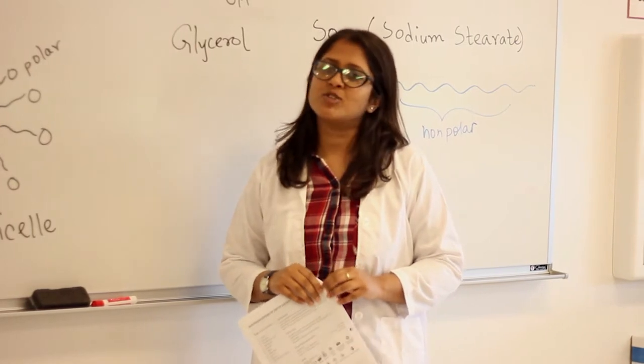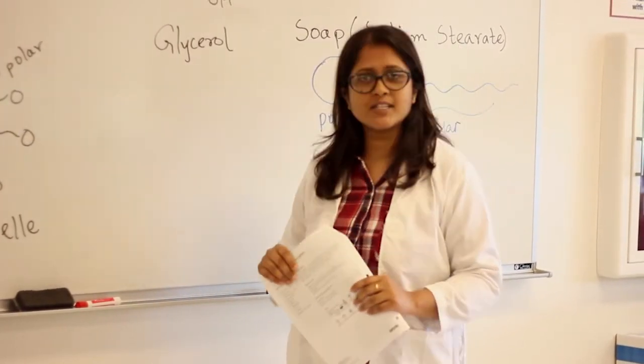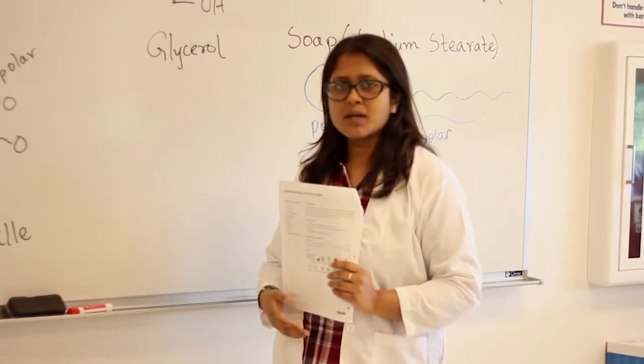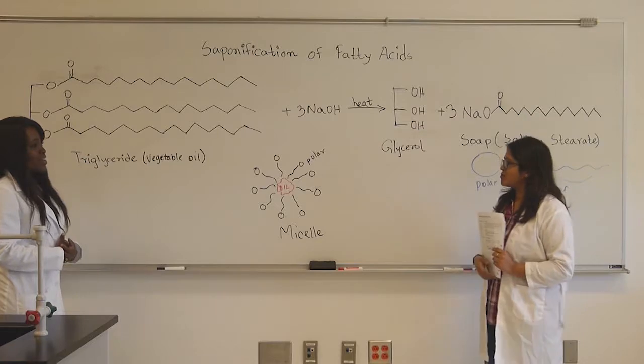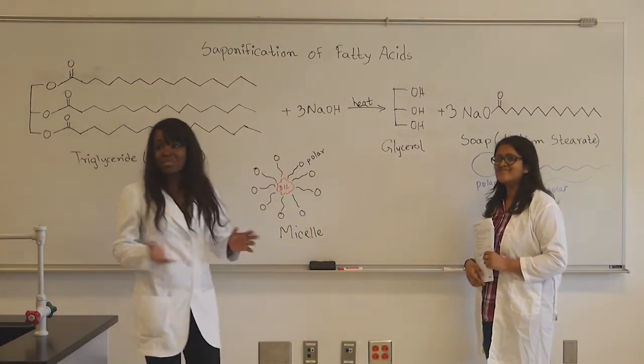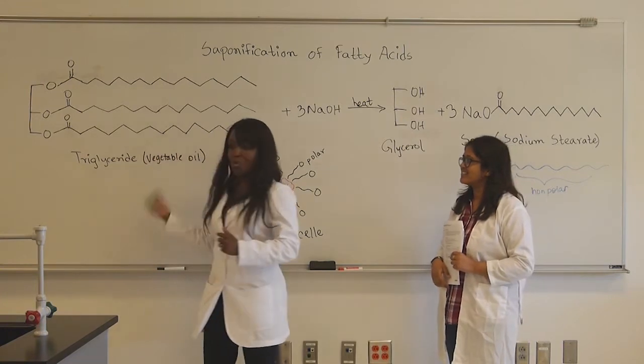1407 lab. So this is lab 8, saponification of fatty acids. Actually, what is that, saponification? We're making soaps today. So, Miss White? Oh yes, so I have a story about soap. As you can see here, in making soap, our reagent is vegetable oil.